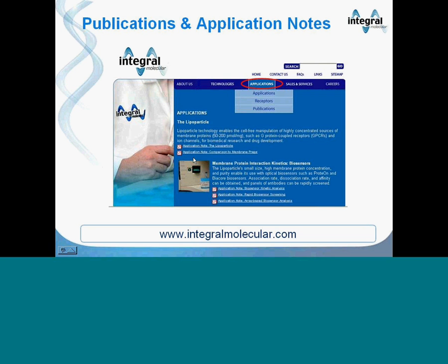Okay, hello. I have a question. Nick Decker here from AstraZeneca. I have a question for Sharon on the lipoparticles. Could you comment on the high density of receptors that you mentioned, typically 50 to 200 picomoles per milligram in your lipoparticles?